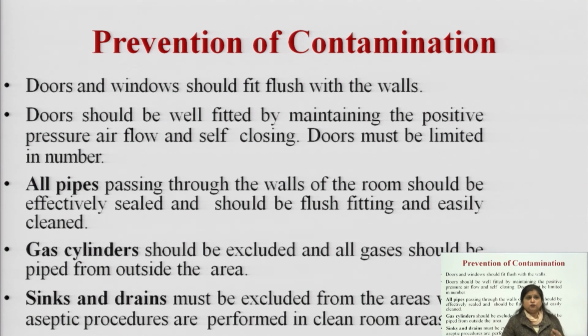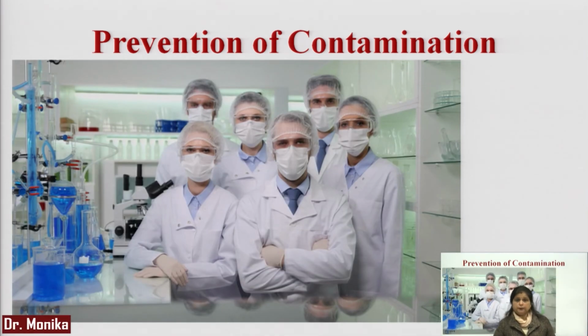All doors and windows should be fitted flush with the walls. Whatever pipes and gas cylinders are there, you have to take extra precautions while installing them.